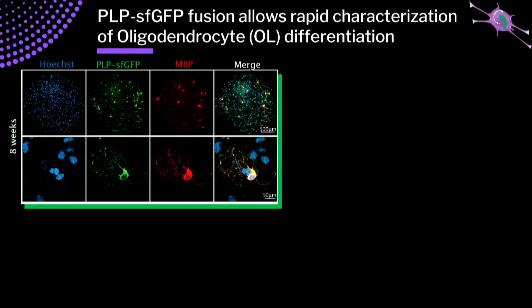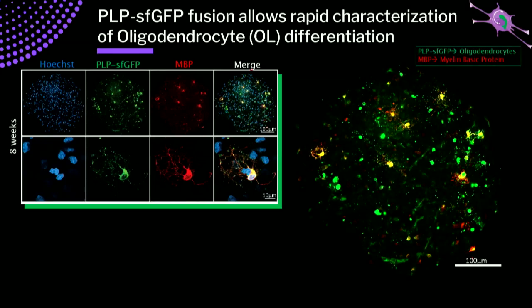Well, because of the light, you cannot see that much, but you can see here the whole sphere. You see some colocalization. Here, zoomed in, you can see a nice oligodendrocyte, and you can see the colocalization of the endogenous and the pseudo-staining. And here in a zoom in, hopefully you can see, I'm trying to point out that you can find 2 different morphologies, and this is something that we can use to screen different toxicants.